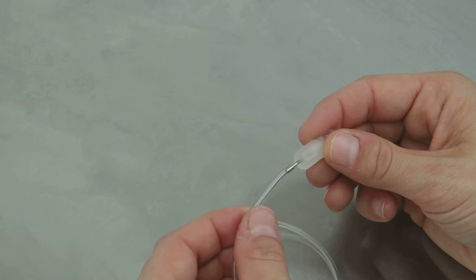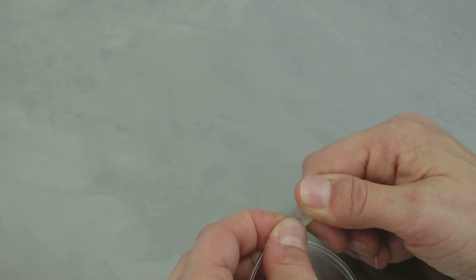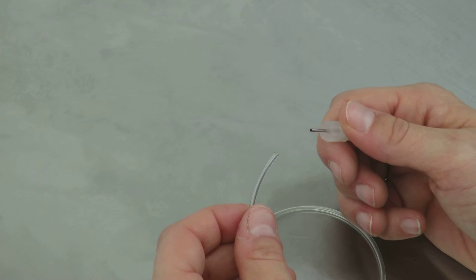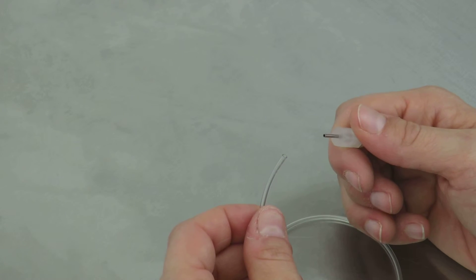To remove the tubing, instead of pulling the tubing off, grip it toward the body of the tubing and slip it off the stainless steel element. This will help protect the fitting and reduce the chance of bending or damaging the stainless steel barb in the process, so it's in good condition for future use.